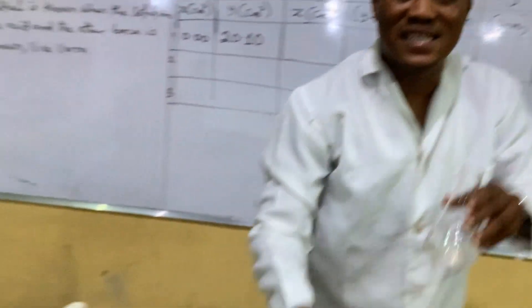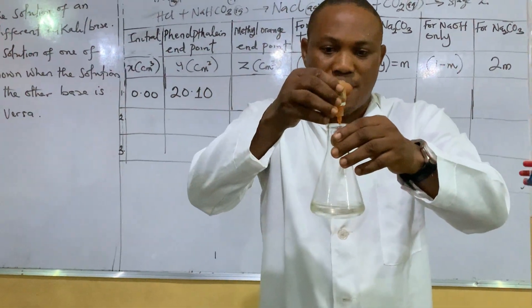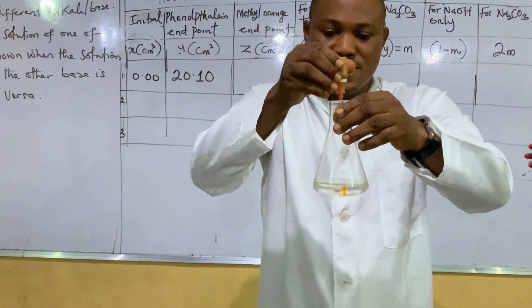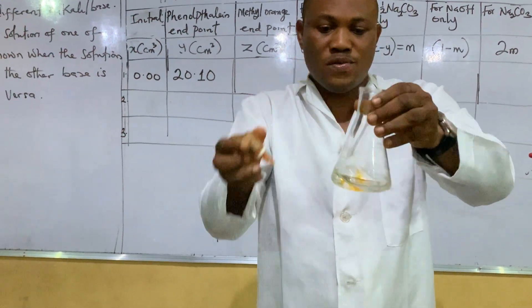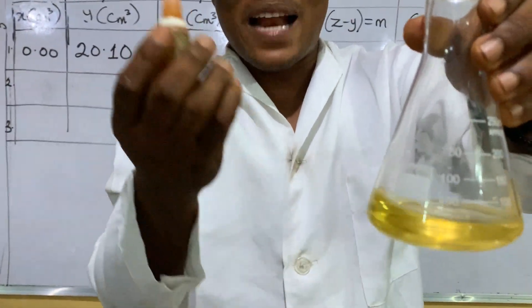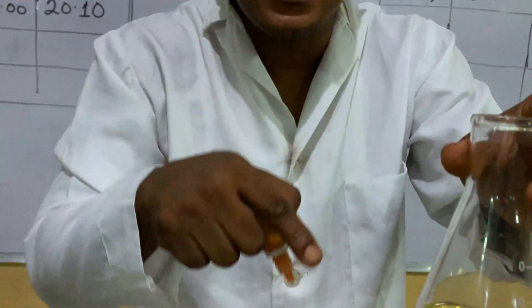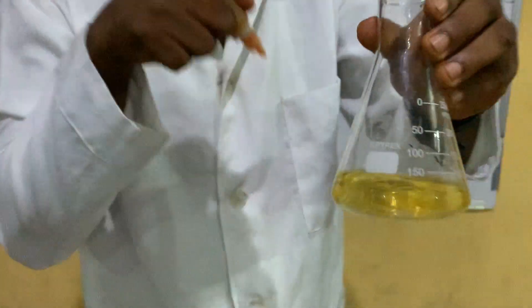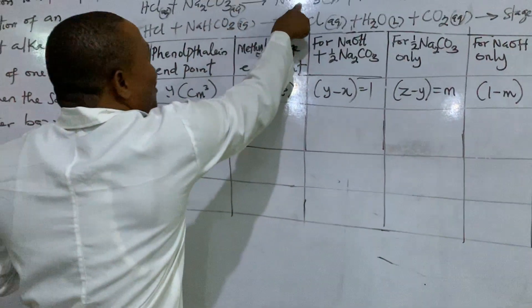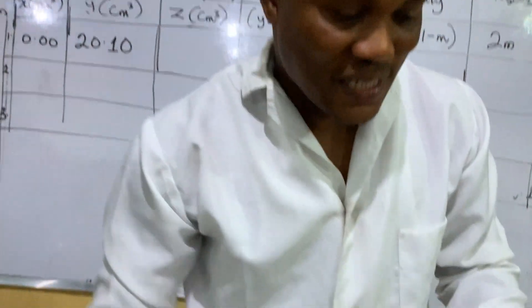Now I will add methyl orange. Do you see where the double indicator titration came from? So I'm adding two drops — one. Did you see? Which means there is a base still remaining. That's why when I added my methyl orange it's changing to yellow, because that's the color of methyl orange in base — which means there is still some amount of base here, which means I still have half.